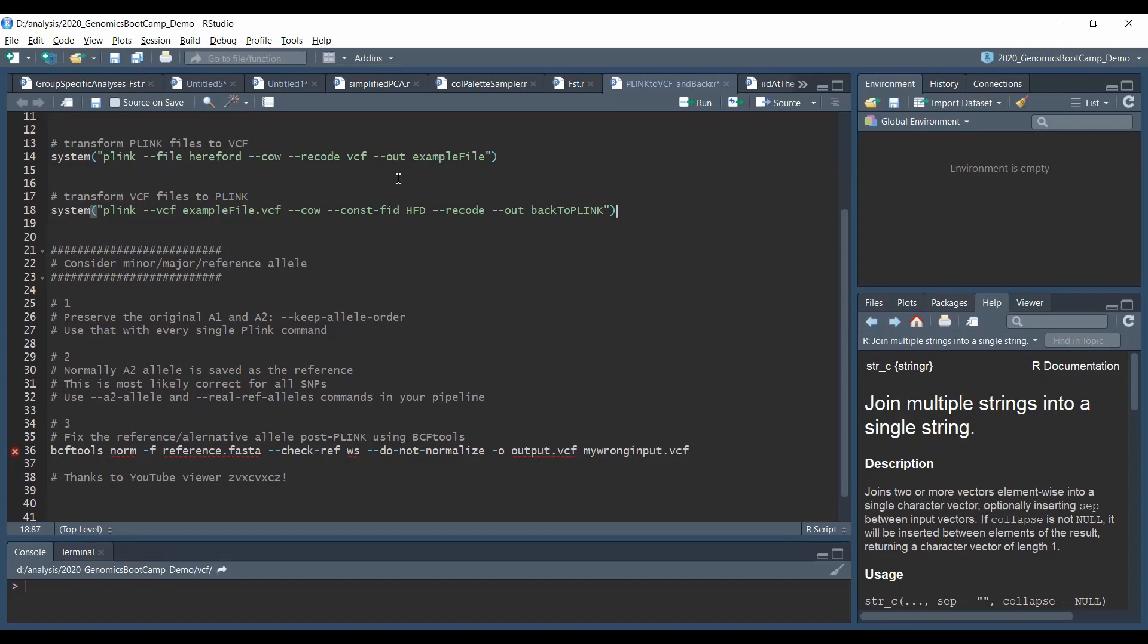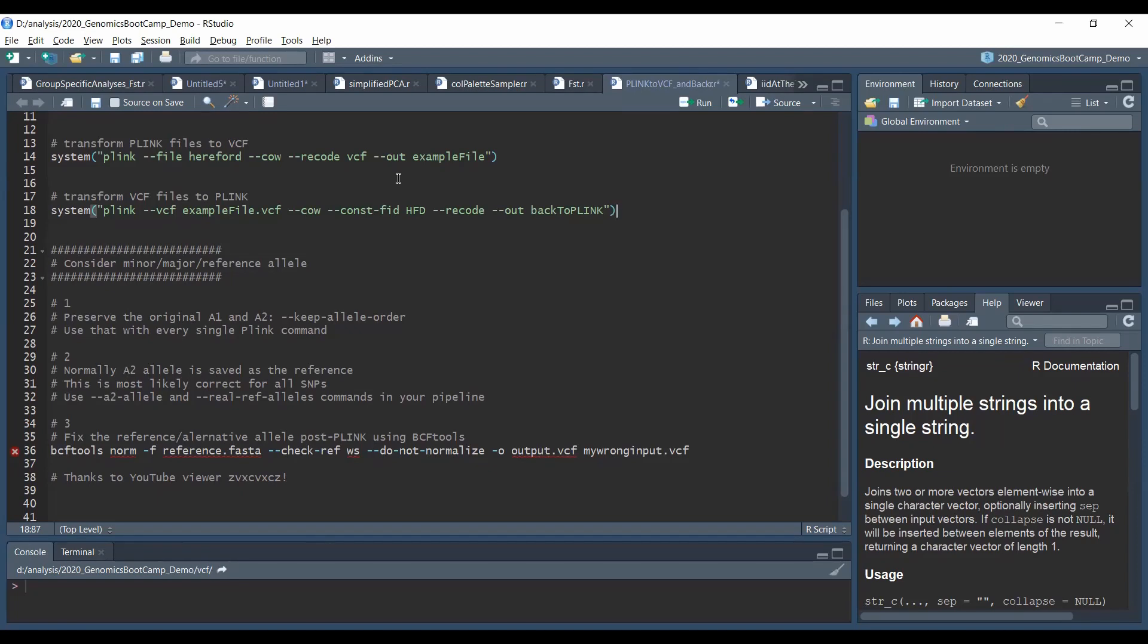Now this is not necessarily the same as the reference allele status when we talk about its relation to the reference genome. The transformation I showed you before, this is in line 14, does not consider reference allele status. So it just goes with the default Plink behavior and puts the major allele as A2. If this is a problem for you or if you really need to have the reference status intact or properly considered, you need to implement additional steps. Now you can do this in various ways. One possibility is to use the dash-dash keep-allele-order command in every one of your Plink lines throughout the entirety of your pipeline. So this will keep the original A1 and A2 allele settings.